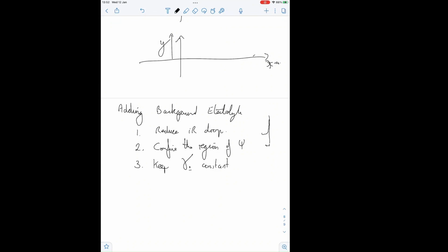Jason, can I ask you something? Yep. So about the counter electrode, you said it should be ideally 10 times bigger. I mean, I guess you could get away with smaller if you know exactly what's going on in your system. But do you think it's always good to, for example, use a multimeter to measure the cell voltage whilst you are controlling the potential of one electrode, just to see? I don't typically do that. Sometimes in the software you can do it anyway. I think possibly if you're having problems, it's probably a good idea.